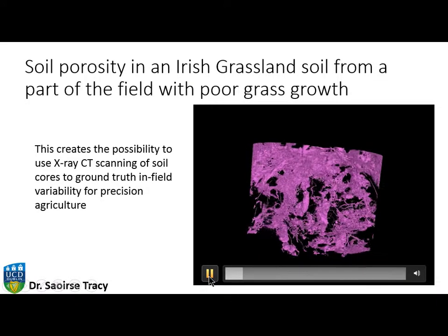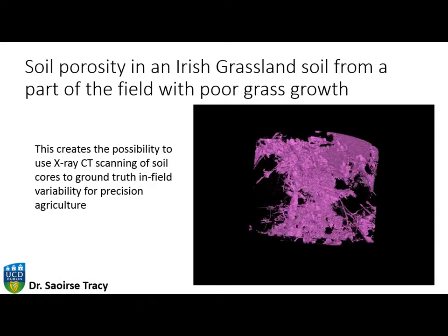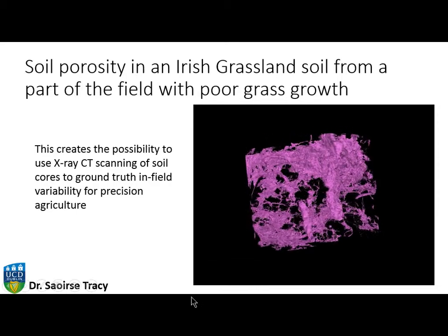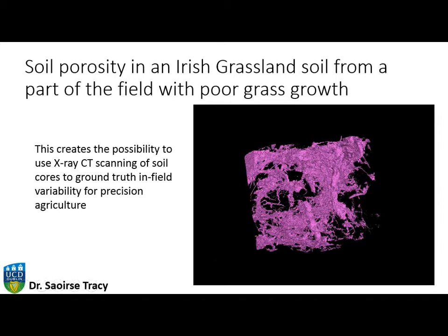This is just one of the videos of looking at soil pore architecture in a field. Potentially this creates the possibility to ground truth the variability in the field with precision agriculture.